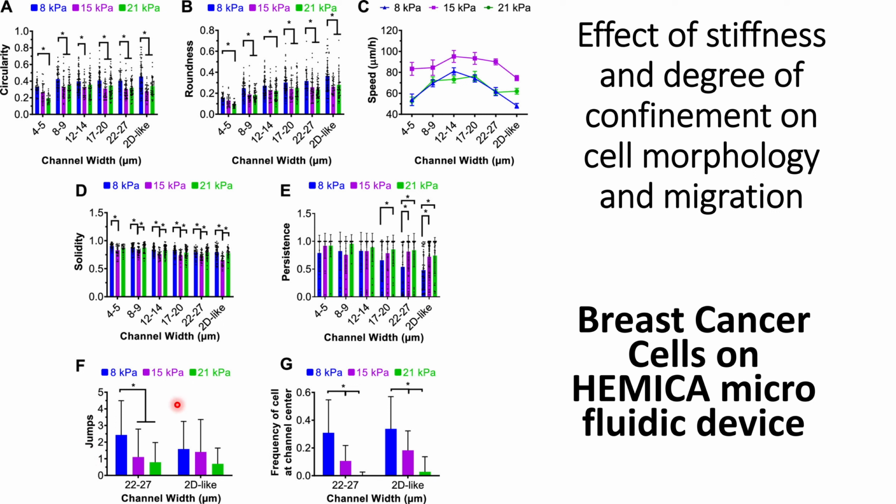The jumps indicate how many times the cells pass the center line of the channel width.